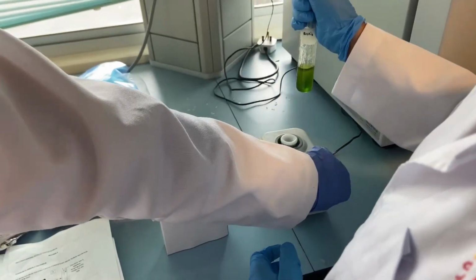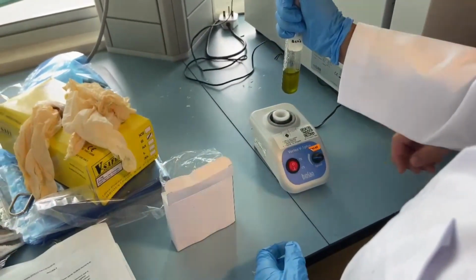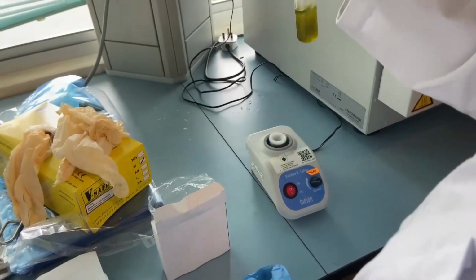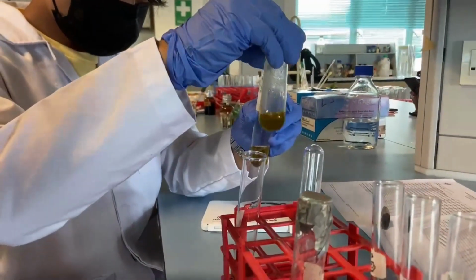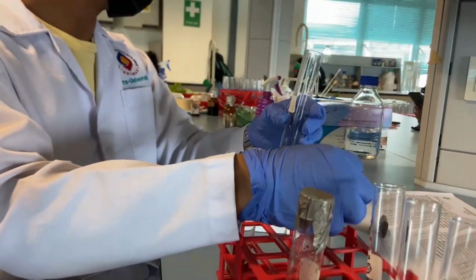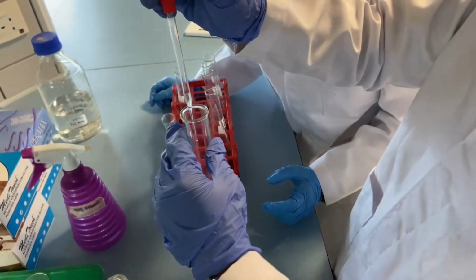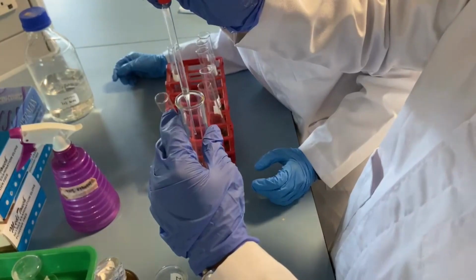20 drops of 2 mol H2SO4 was added and mixed well. The sample was observed for 5 minutes to see if there were any traces of the chloroform layer. The aqueous layer was needed for the alkaloid tests. An equal amount of extract was placed in 3 different test tubes, each for a different test. Label A for Mayer reagent added, label B for Wagner reagent added, and C is for the control.